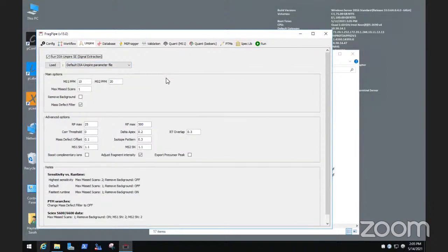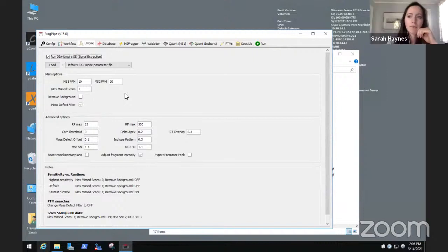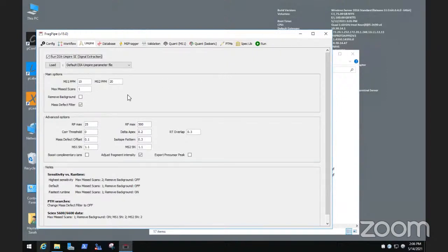And here you have some options that we can take a look at now. You can use default options, and there are instructions for how to change them. If you don't mind longer computational time, you can set some options, as recommended, to high sensitivity. If you want to run as fast as possible, there is another option, and the default is sort of the optimized analysis. So if you would like to build a hybrid library, and after that, I think we'll conclude.